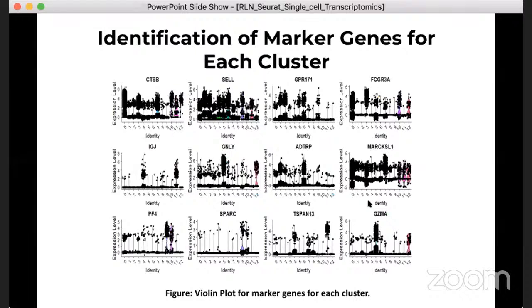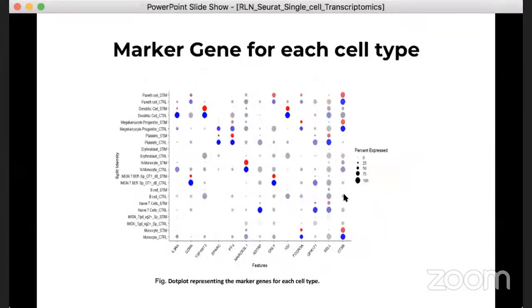So what do we have next? Next, we want to understand the marker gene expression patterns that are specific to each cluster. This can help us annotate the clusters based on cell types, and further we can also perform a differential gene expression analysis for the marker genes across different clusters or across different cell types. This is a very poor and broad graph, and I will show you another graph which takes only a couple of examples that will be very clear.